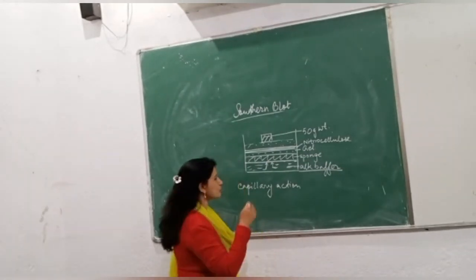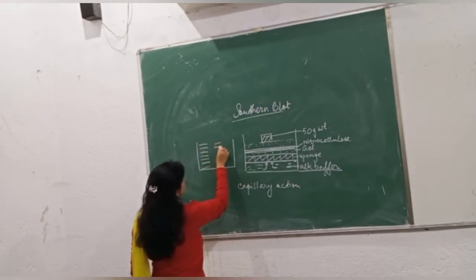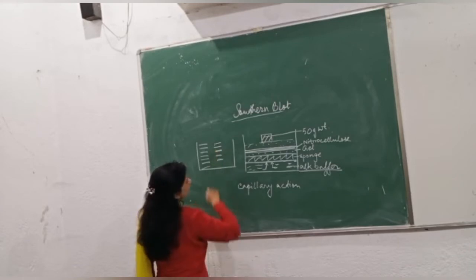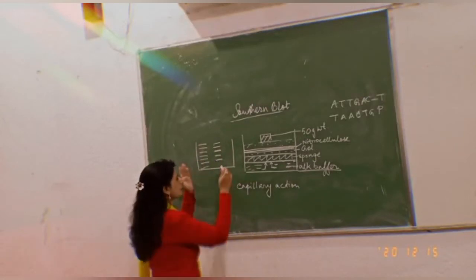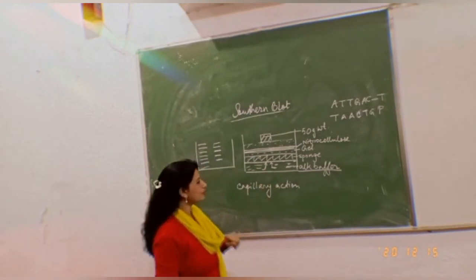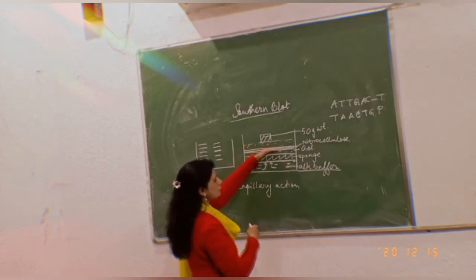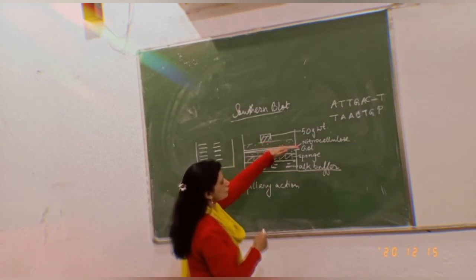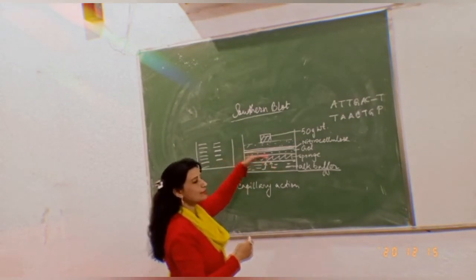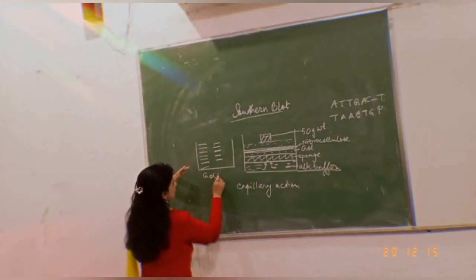The motive was, what was the motive? That pattern I got in my gel electrophoresis method, where I had agarose gel, loaded my DNA into it, and got the pattern. But that pattern, where is my target DNA? You understand? I have to prepare the exact replica. How do I get it? I have applied all the method, that is, this nitrocellulose membrane which was aligned with the gel. The DNA molecules moved up, buffer molecules also moved up, DNA remained in the nitrocellulose membrane, giving me the exact replica or the exact copy of the image that was already prepared by me using the gel electrophoresis method.